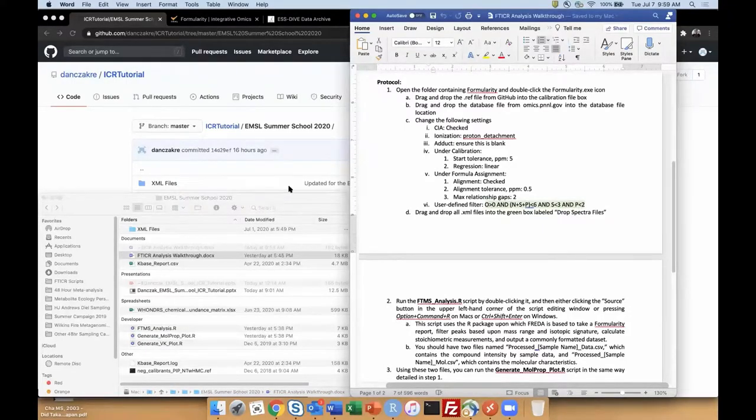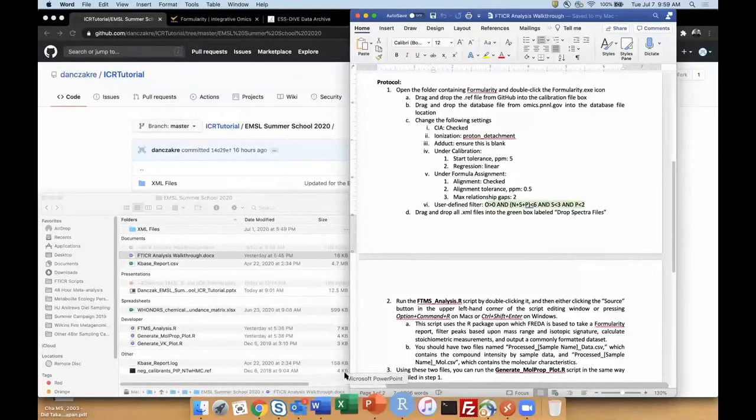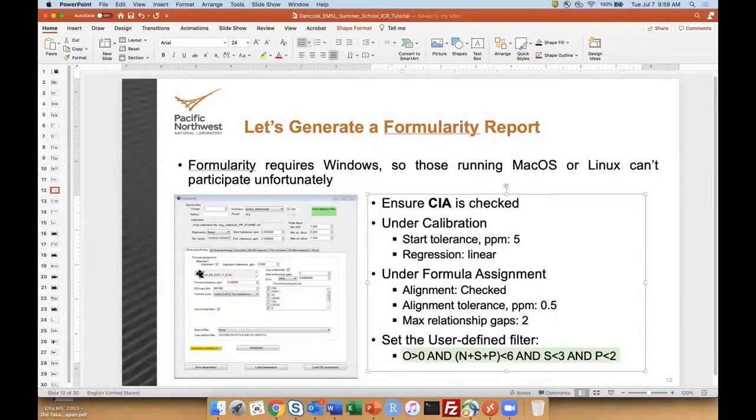Regarding not checking the CIA, that is interesting. So just to make sure, you do have the Woods Hole database. In your case, it would just be the db.bin file. It doesn't have the GUI part on it. You do have that loaded. And you do have everything else down here, as well as use relationships checked.